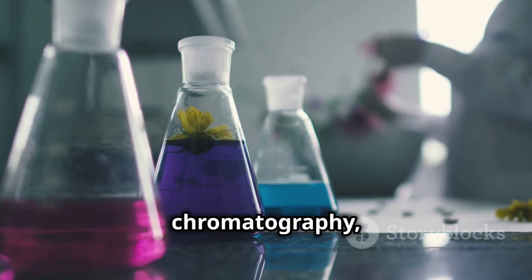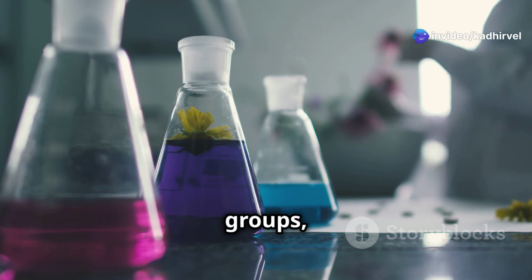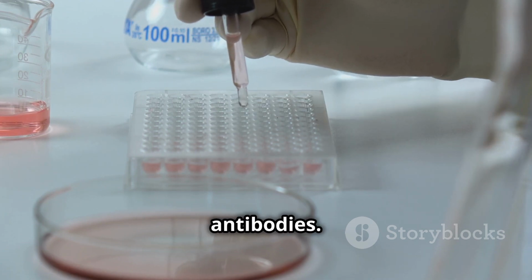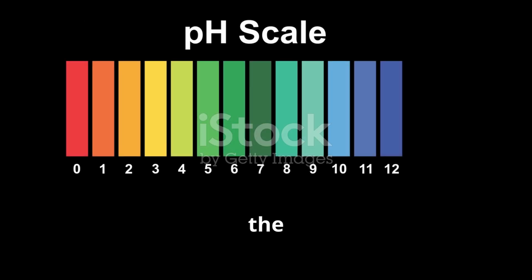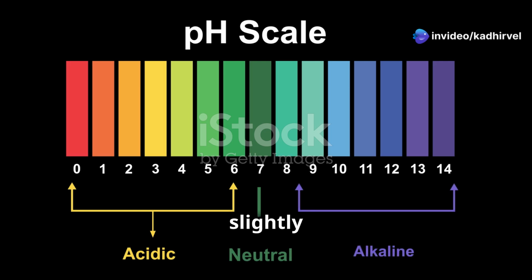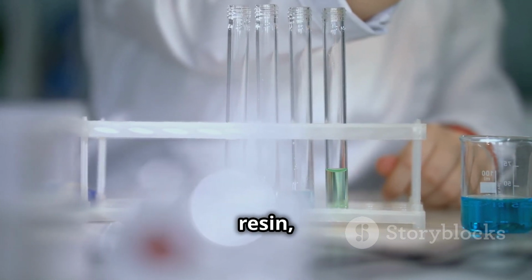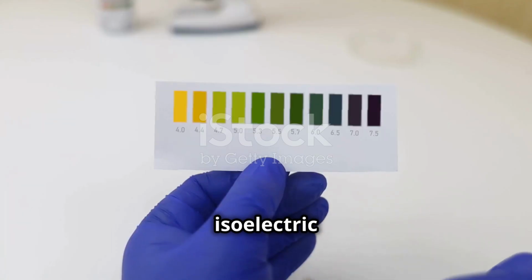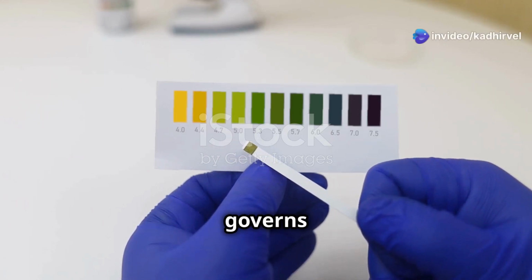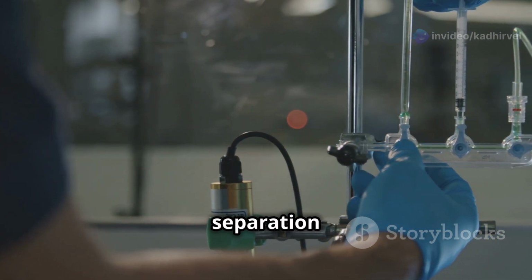In cation exchange chromatography, the resin is functionalized with negatively charged groups, such as sulfonate groups, which attract and bind positively charged species, like monoclonal antibodies. At a specific pH, both the main monoclonal antibody and its acidic variants are positively charged, but differ slightly in their charge densities. This difference affects the strength of their binding to the resin, allowing for their separation. The isoelectric point of the main monoclonal antibody form and its acidic variants governs their net charge under different pH conditions, which is key to selecting an effective separation pH.